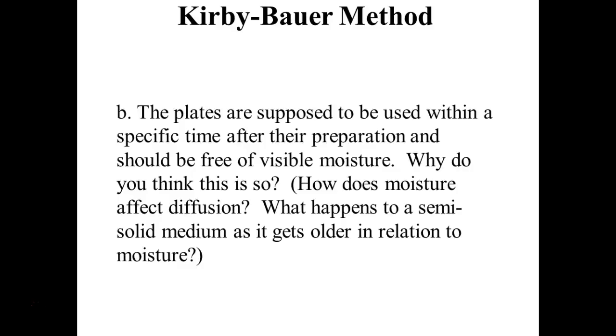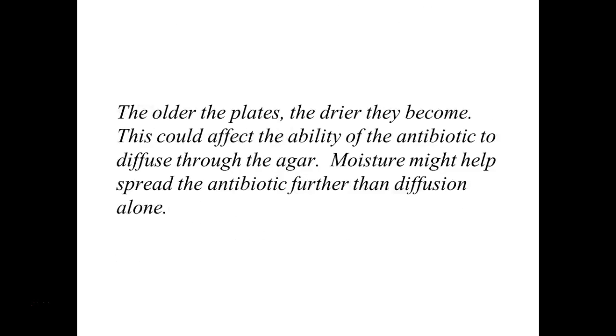The plates shouldn't have any visible moisture. Does moisture affect diffusion? If I was to take a dry paper towel and a wet paper towel, and I put a drop of dye on the dry paper towel as opposed to the wet, which one's going to diffuse further? The wet. Because the moisture is going to help that dye diffuse. So we don't want these plates too moist because what's going to happen? It's going to increase the diffusion rate. But if they're too dry, that could be a problem too. So they have to be fresh. They need to not have too much moisture.